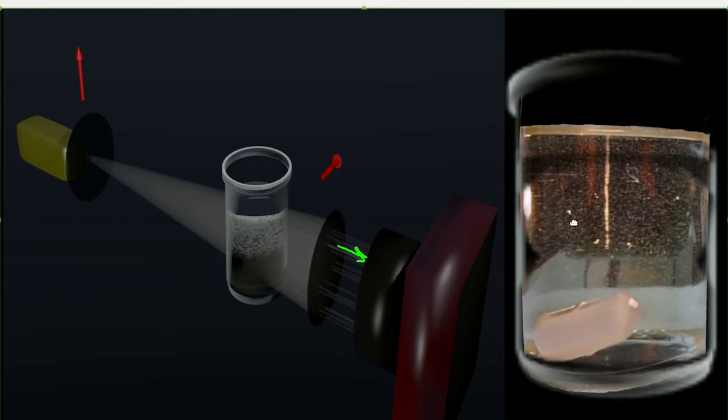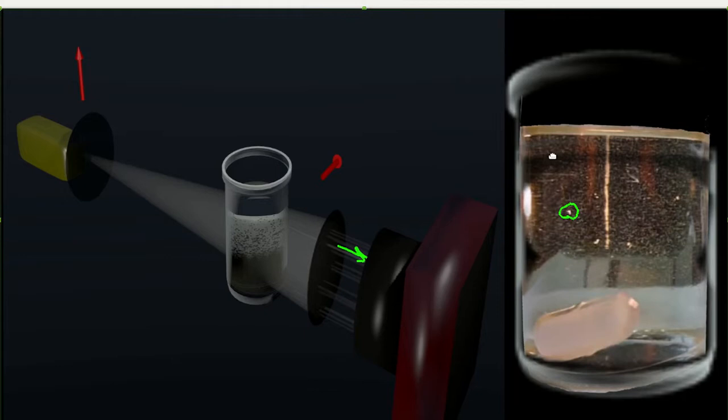The resulting image shows the bright spots of the API where the light has been rotated and hence passes through our analyzer, whereas the unrotated light that goes through our air bubbles for the most part is not detected.